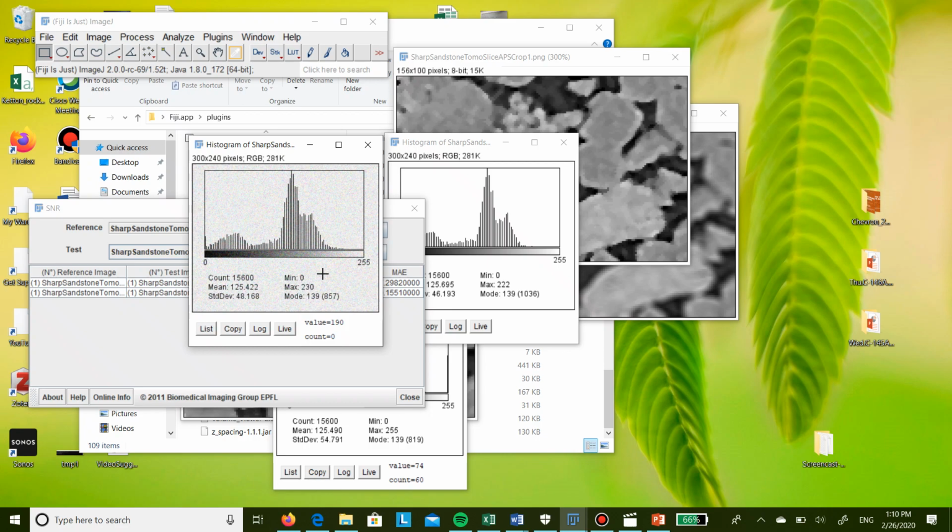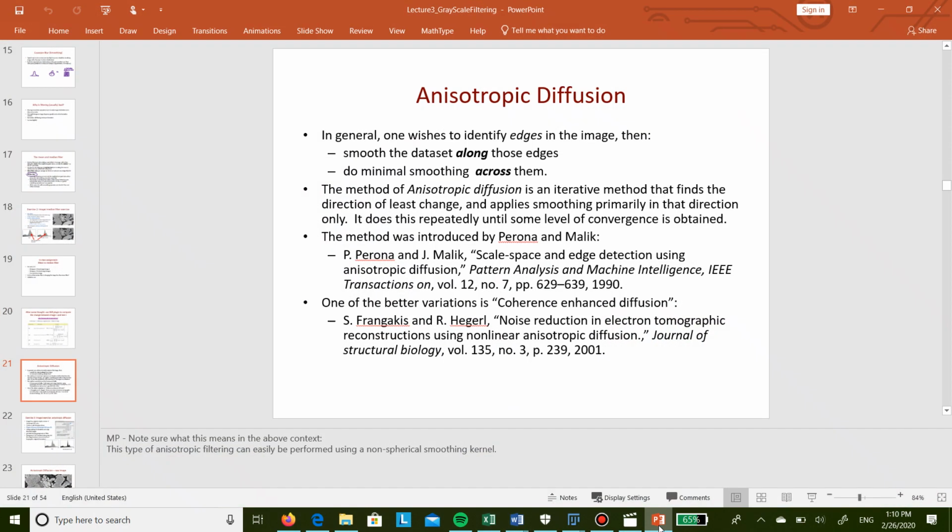It's an image, right? The histogram output is an image, so ImageJ is saying, sure, I can add noise to that. Hilarious. And it's an RGB image, so I have added colored noise. Okay. Shall we do a histogram of a histogram? No, just kidding. All right. Everything is an image.